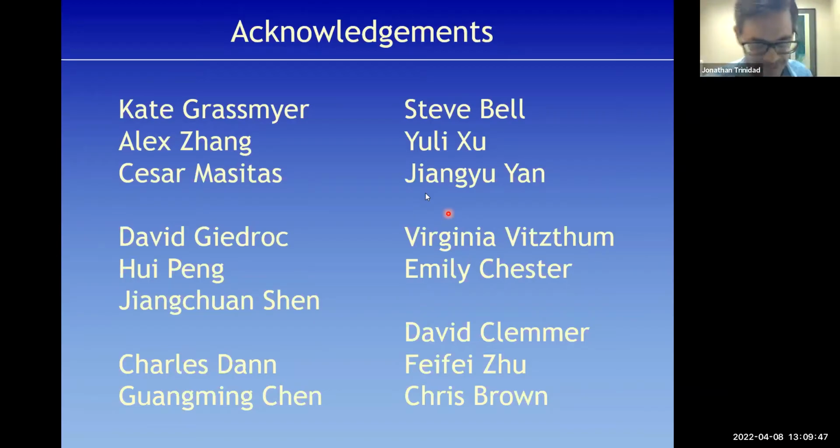Obviously you're looking at multiple classes, but exosomes themselves we might find 500 proteins in them. Maybe some of those are impurities, maybe not. And so if that's where you are and you are prepared to biochemically beat on it hard enough with increased sample amounts and increased LCMS time, you could probably find in the mixture of digests some cross-linked peptides.